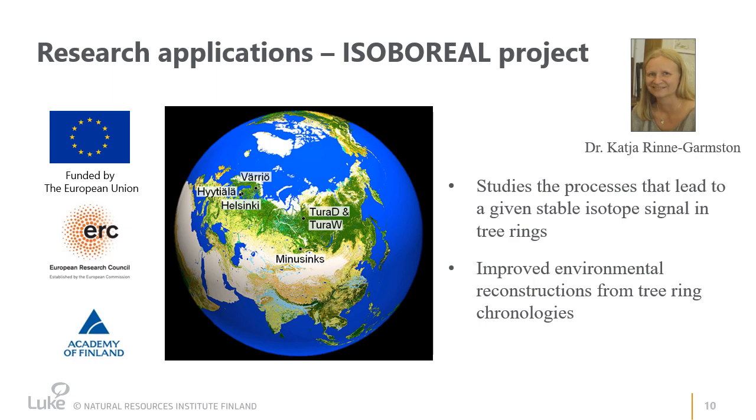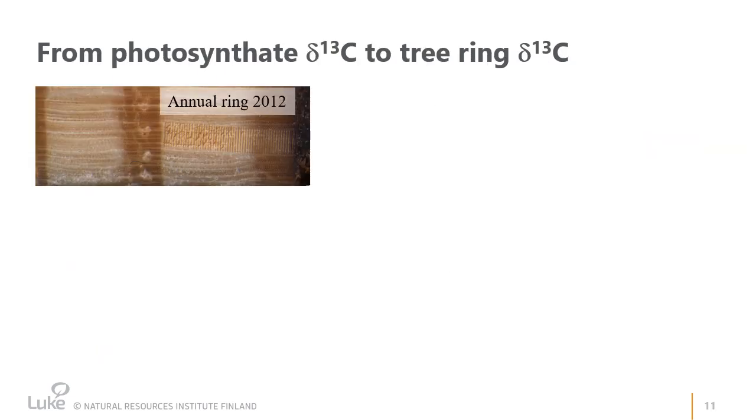For this purpose, for carbon isotopes, we have followed how an isotopic signal is modified along the pathway from atmospheric CO2 to sugars and finally to the intraannual carbon isotope composition of tree rings. This knowledge enables us to obtain better reconstructions of environmental change from tree ring chronologies.